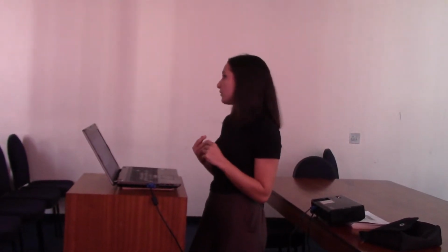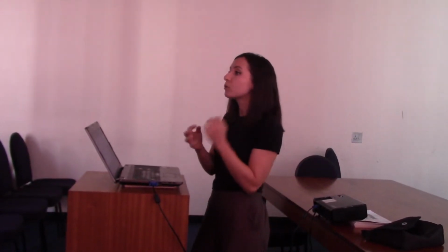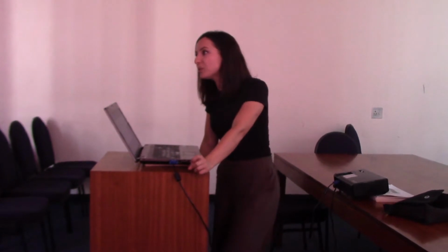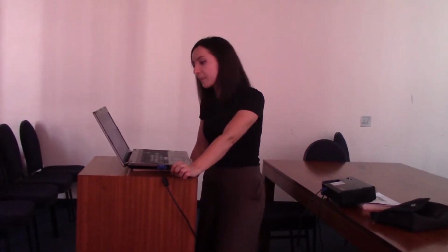It becomes important. So when choosing your research questions, you also need to think about RNA yield. Some samples just do not give you enough RNA. And RNA-seq doesn't need a lot of RNA, but if you're only going to be able to scrape out a few nanograms, you're dead in the water from the get-go. So understand what tissues, and I think Tandeka knows the heartache of working on a sample that will not yield you enough sample. It's devastating, so definitely before you plan a huge project proposal on roots of the banana leaf, find out can the roots actually give you RNA.